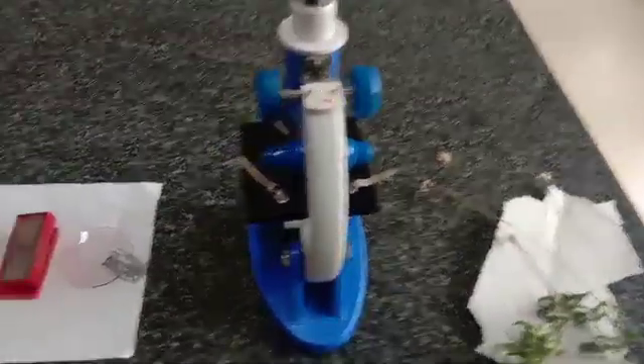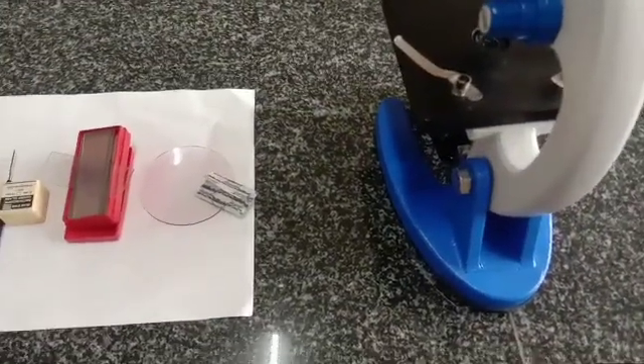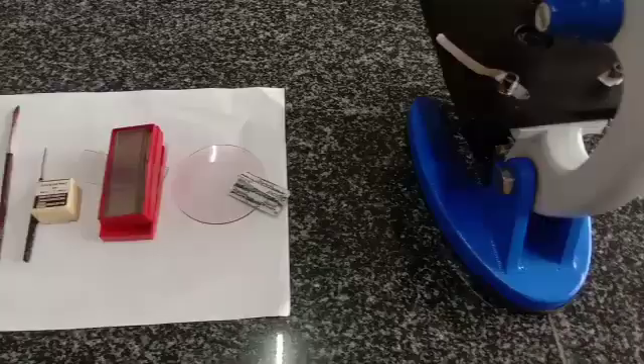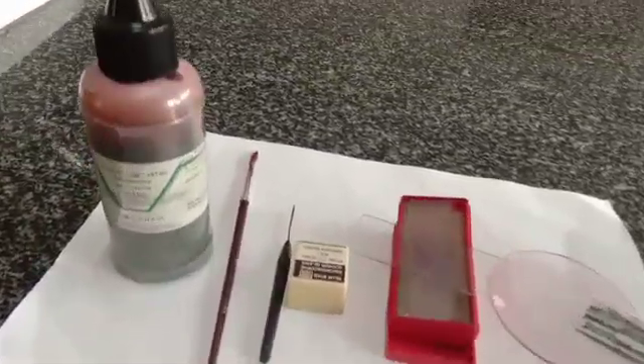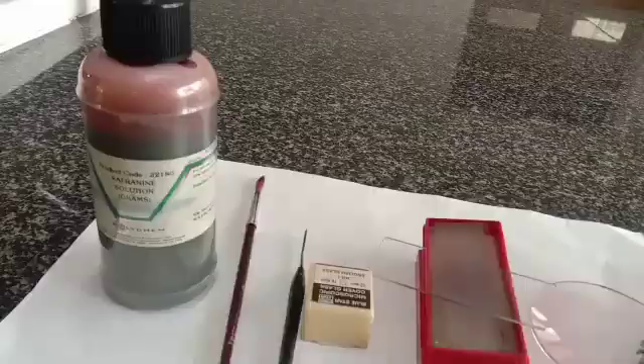Practical study of dicot stem. Requirements: Tridex plant, a compound microscope, sharp blade, watch glass, slides, cover slips, needle, brush, and safranin stain. Procedure: take a small piece of Tridex stem like this, cut a small piece.